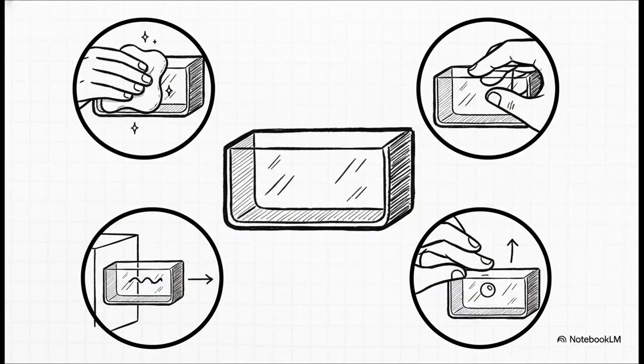Now, this stuff might seem a little picky, but in science, precision is absolutely everything. A tiny fingerprint, a little air bubble, or even just putting the sample container in sideways can completely throw off your data. So wiping the container, handling it just by the edges, and making sure the light has a clear path, these little details are what make our map accurate.